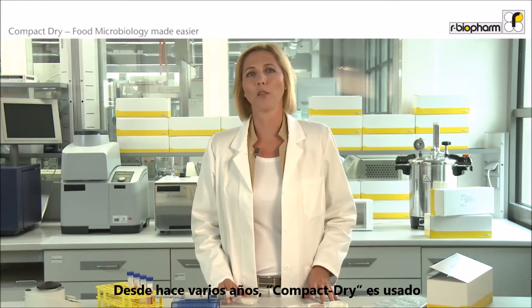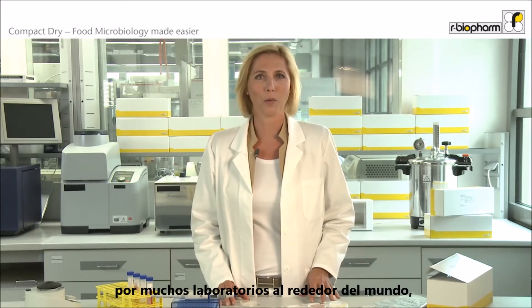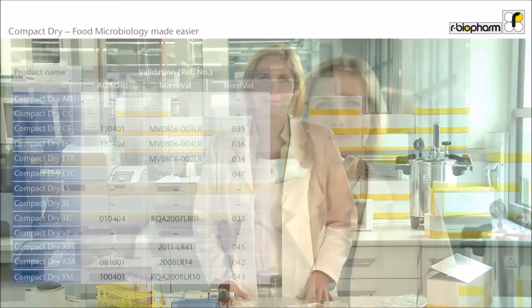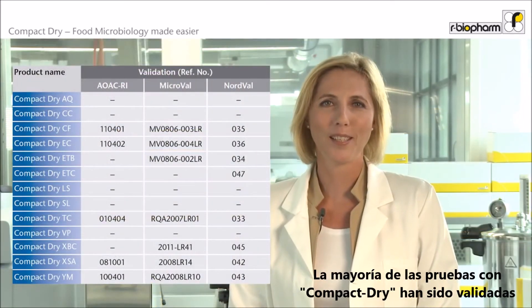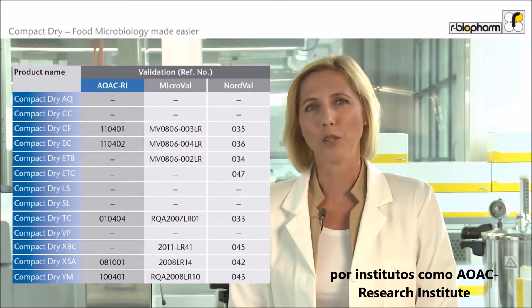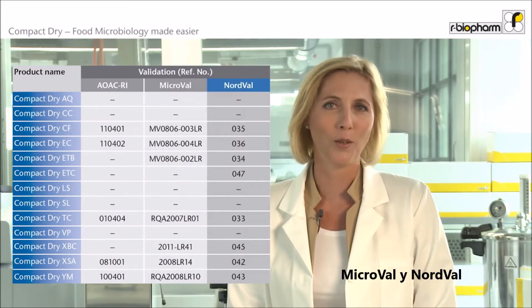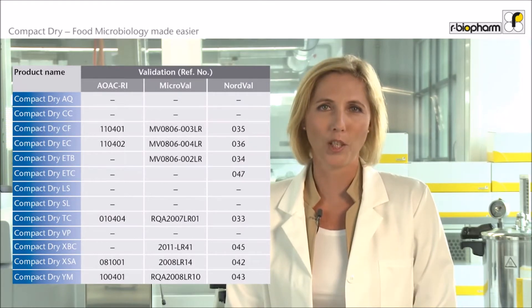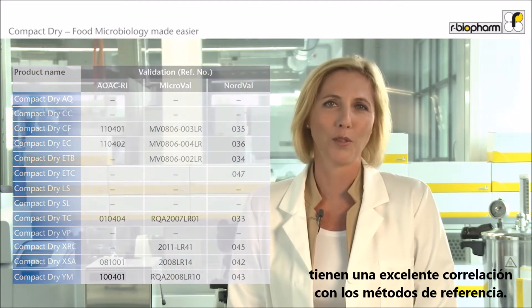Compact Dry is a robust and very versatile product. Since several years, Compact Dry is used by many laboratories all around the world for microbial food and environmental testing. Most Compact Dry tests have been validated by institutes like AOAC Research Institute, MicroVal and NordVal, so you can be sure results obtained with Compact Dry show an excellent correlation with reference methods.